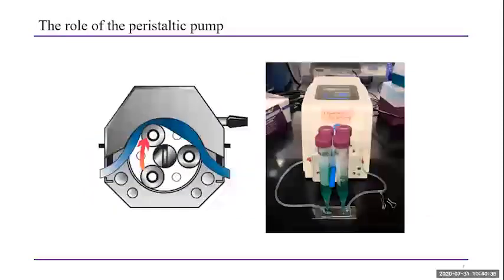A peristaltic pump generates a continuous flow of liquids. The role of the peristaltic pump in this project is to generate a continuous flowing center channel for our device, into which our 2 outer culture channels can then flow. With an off-chip sampling port incorporated into the peristaltic tubing, it allows for fast and easy sampling of the extracellular media in order to identify the excreted biomolecules involved in cell-to-cell communication. Circled in yellow, we see a binder clip, which is used to hold the tubing shut to allow for the sampling of media.